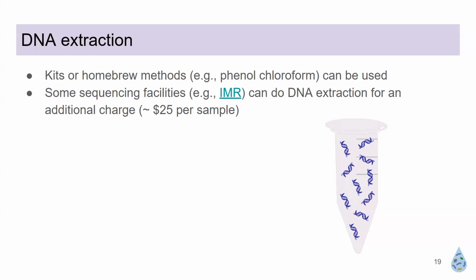Some sequencing facilities can also do DNA extraction for an additional charge. The downside to this is that they're going to extract it with a basic protocol. So if you have a tougher sample, or you need some optimization to your DNA extraction, they're not going to do that for you.